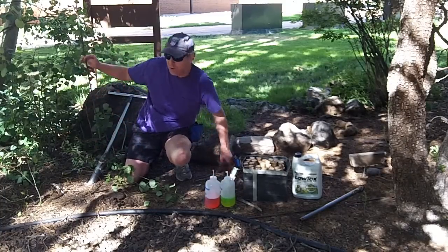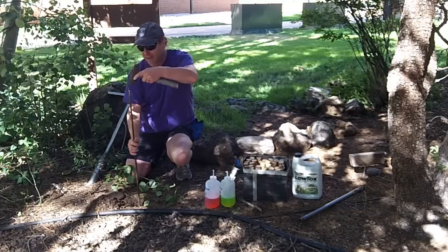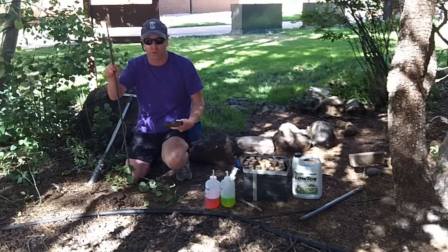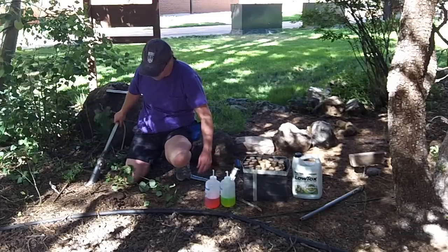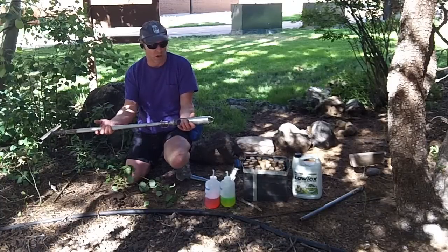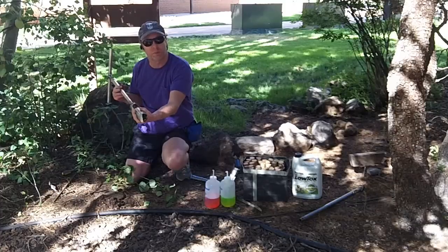The first thing we do before putting a pitfall trap in is tap down with a hammer and a small piece of rebar to make sure we don't hit rock or a root. Once we've decided we can dig, we use a 2-inch soil auger from Forestry Suppliers.